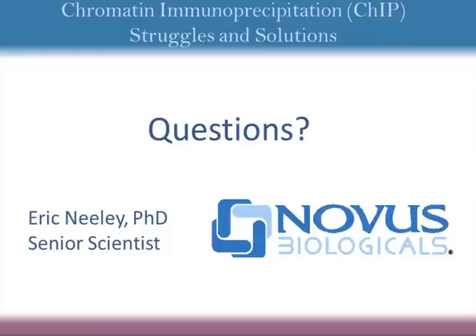And so if you want to stick with the agarose and you're not doing a blocking step, I definitely recommend you do a pre-blocking step of the beads, and you really should be having thousands of percent less amplification of your no antibody controls versus your actual antibody IP, because I have looked at similar data from people that were using beads that they were saying they had a significant increase in a gene versus a no antibody control, but the fold change was 1.5, and the fold change should be hundreds and hundreds and hundreds apart. Yeah.